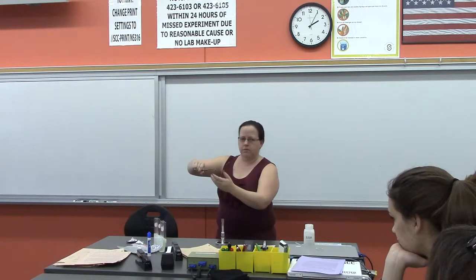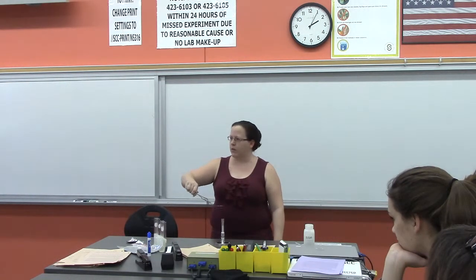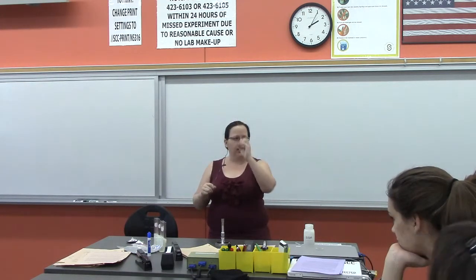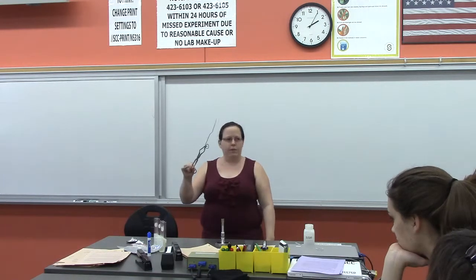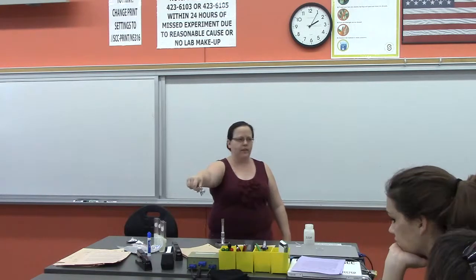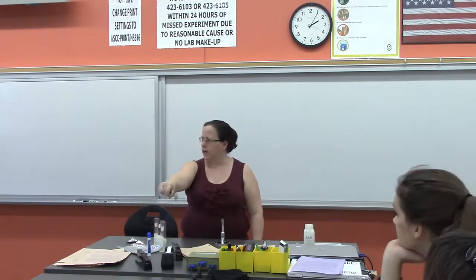This might take a little finessing till it's not wobbling around. Go back and forth in the flame for a little while. If you take it out of the flame and you notice it changes color, you're done. It should only take a couple of seconds in the flame. We do not want to put the hot copper on the gray countertops. They'll melt. That's why there's tiles. Okay, so take your nice hot piece of copper, set it on the tile, let it cool for a couple of minutes.